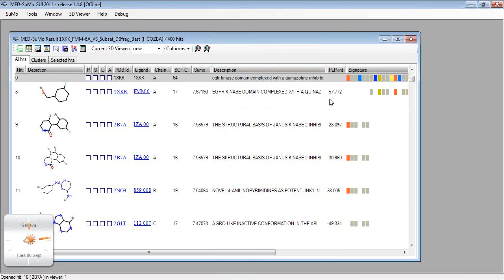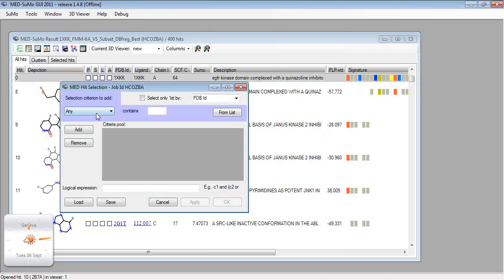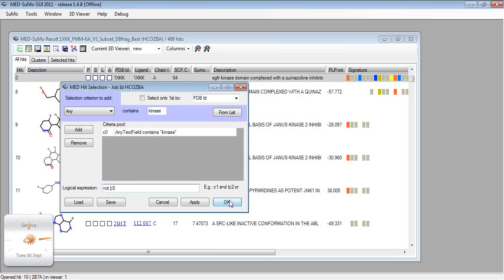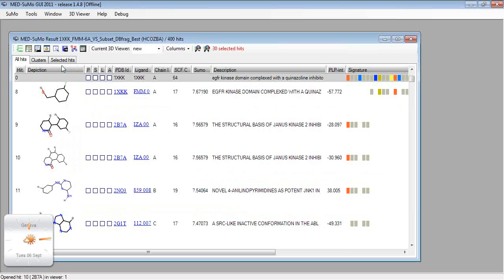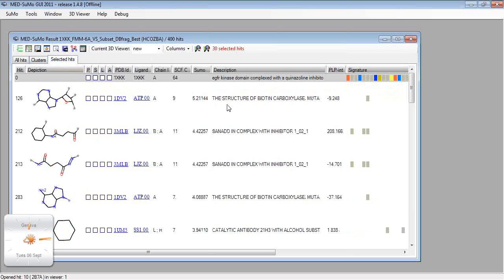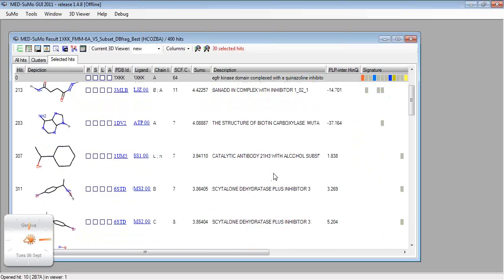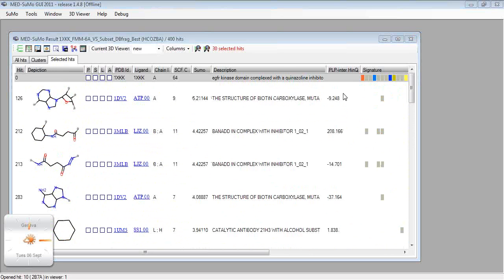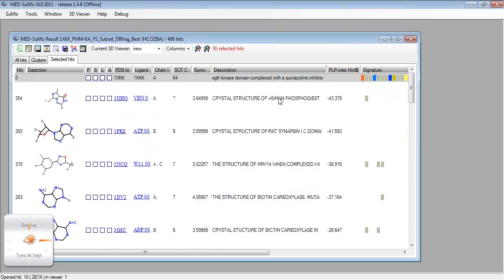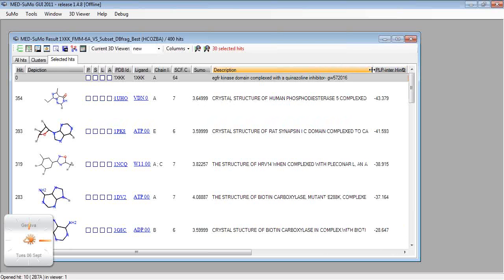We can also select and see the hits which are coming from protein kinases and those which are not. Let's visualize the ones not from protein kinases. We have 30 hits among those 400 which are not coming from protein kinases. As they are selected, we can go to the selected hits tab. Here we have the hits with the scoring function — it's more interesting when the value is negative, meaning the fragment fits nicely. We can visualize some of them by sorting according to PLP inter, so they are sorted by likelihood to fit.